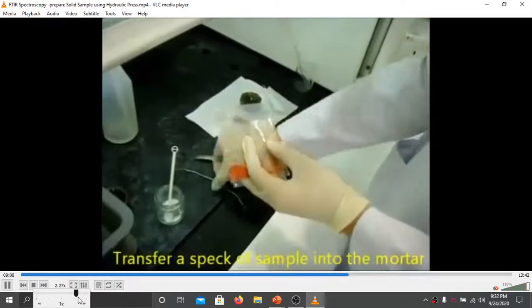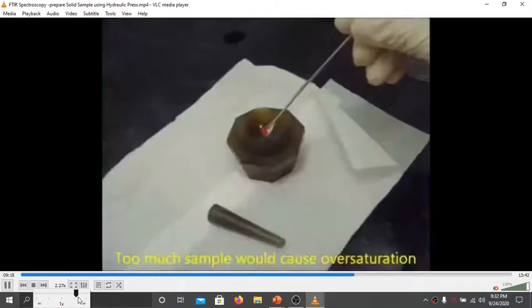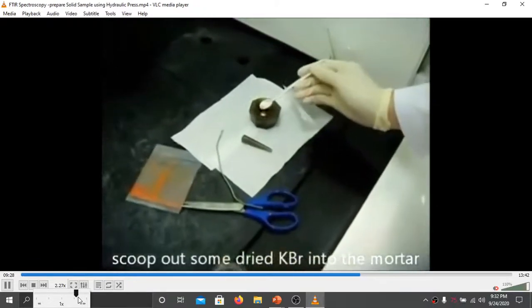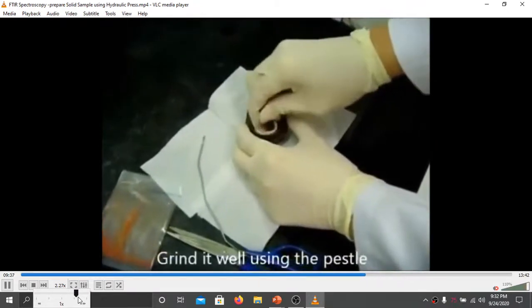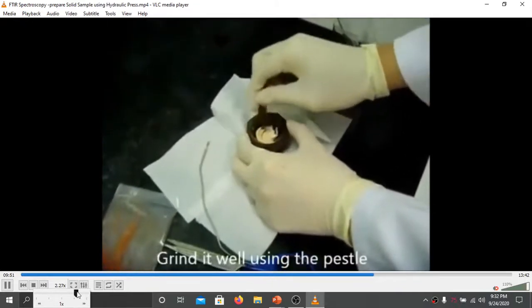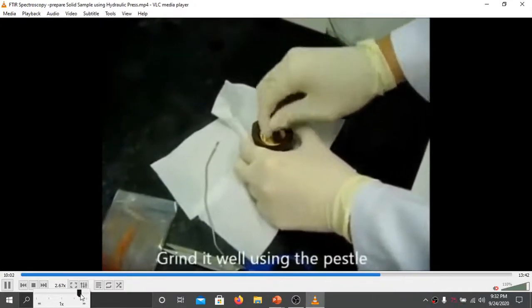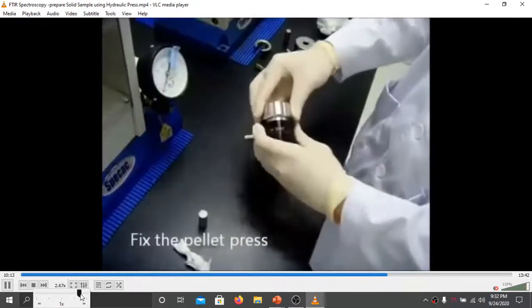Okay, a small quantity of sample is to be placed into the mortar and pestle. Too much sample should not be used. Dried KBr is added, in such a way that it will get thoroughly mixed. Grind well using the pestle for a sufficient period of time.